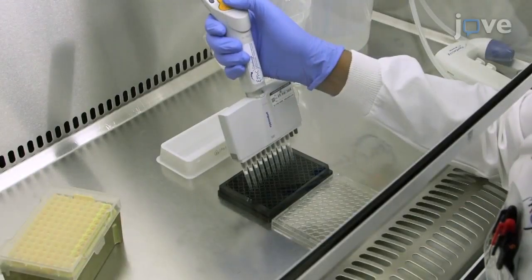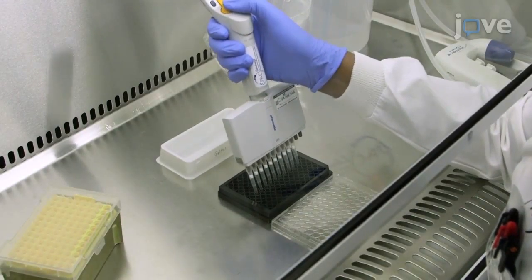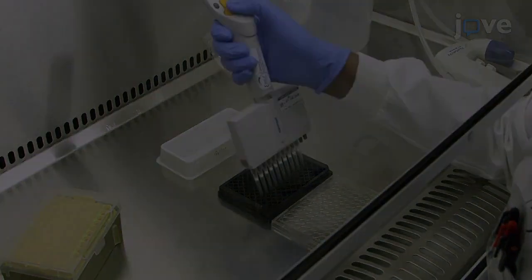To set up a pre-activated CD8 positive T cell target cell co-culture, first add 30 microliters.